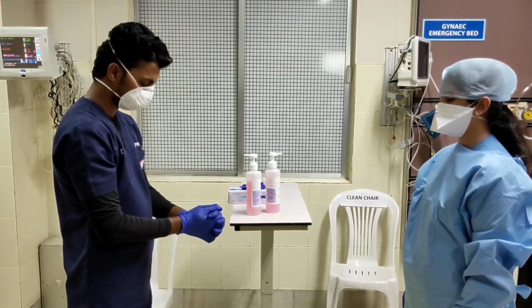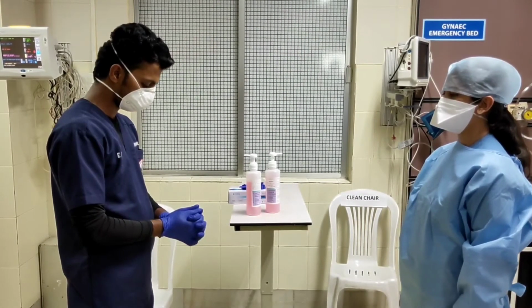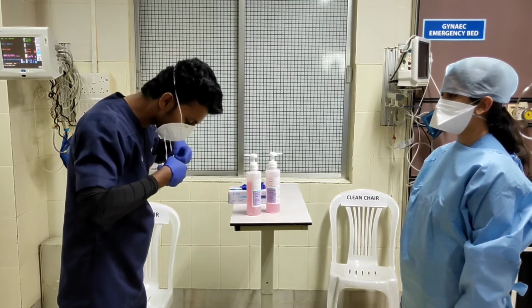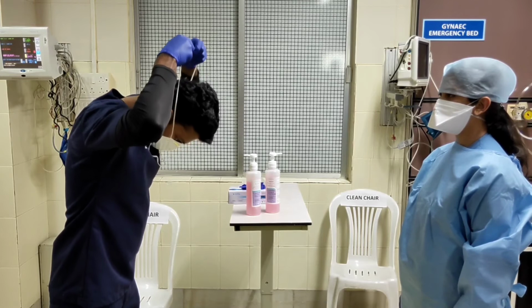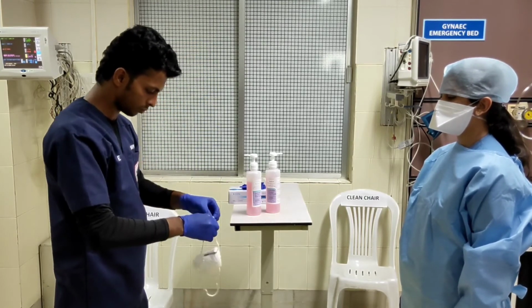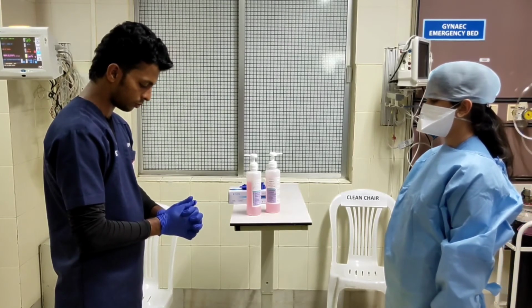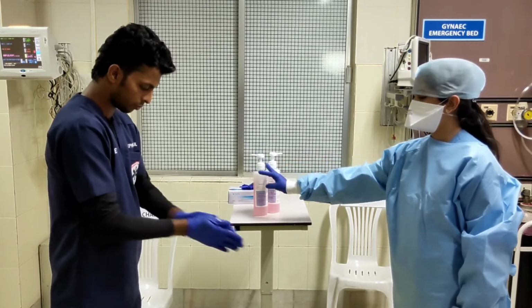Once you have put on a new pair of gloves, you can now remove your N95 mask. For removing the N95 mask, bend your head forward and pull out the lower string of the N95 mask. Let it down. Now pull on the upper string, pull up and slowly pull it forward while taking your face back, allowing the mask to fall off to the ground, and now discard it off. After this, again disinfect your hands.